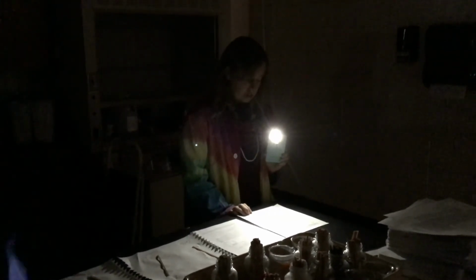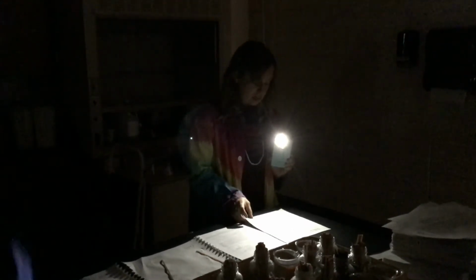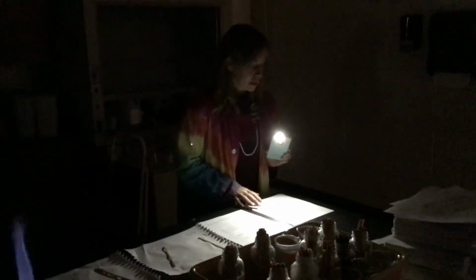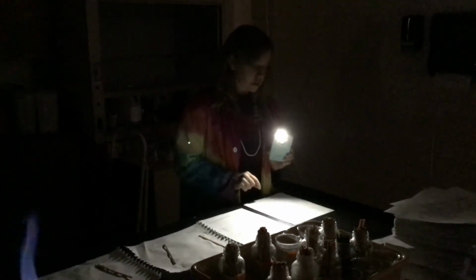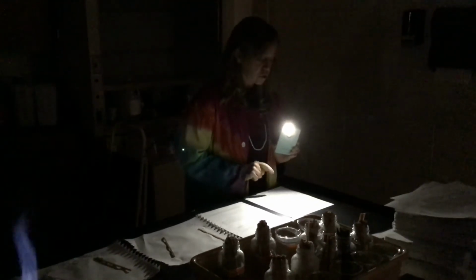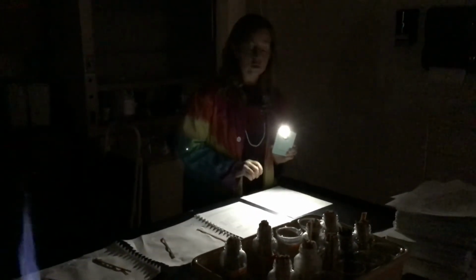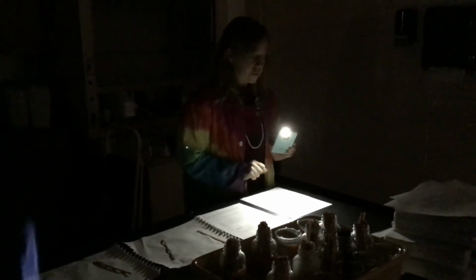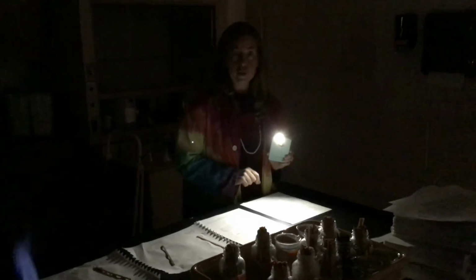In this investigation, you will have an opportunity to conduct a flame test and use a spectroscope, 3D glasses, to identify 4 unknown solutions. So, your task in this lab, okay, is to determine the emission line spectrum of 6 different powders, then determine the identity of 4 unknown solutions using a flame test, a spectroscope, and the emission line spectrum from the 6 known solutions. Now, the guiding question for this investigation is, what are the identities of the unknown solutions? Okay? I'm going to end here.